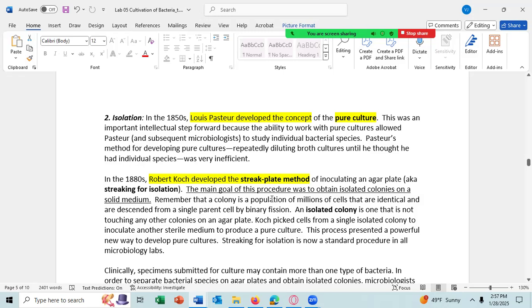It's likely to be over a 95% chance that it's a pure culture, meaning one of the colonies was likely formed from one cell or very few cells, which are derived from one cell.